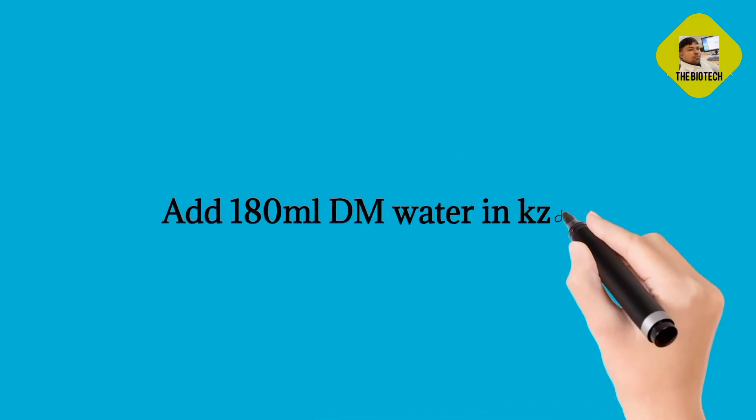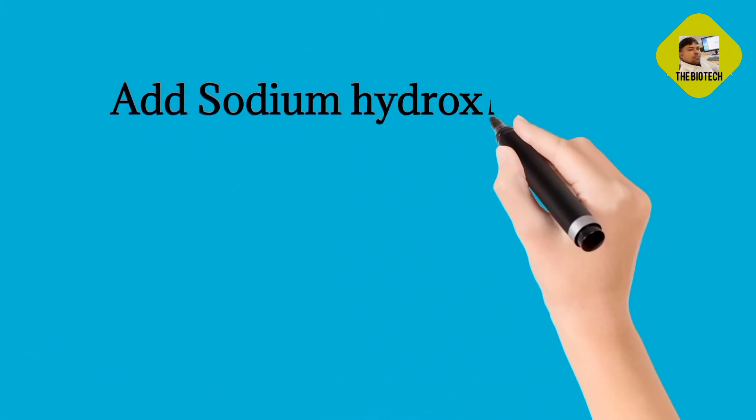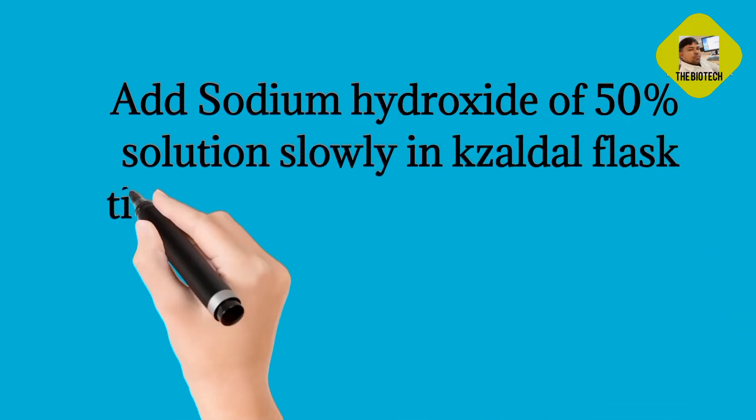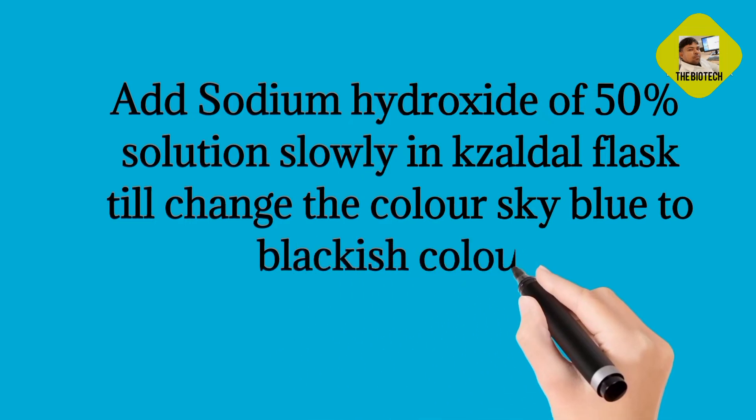Add 180 ml DM water in the Kjeldahl Flask. Then add 50% Sodium Hydroxide solution slowly into the Kjeldahl Flask until the color changes from sky blue to blackish color.